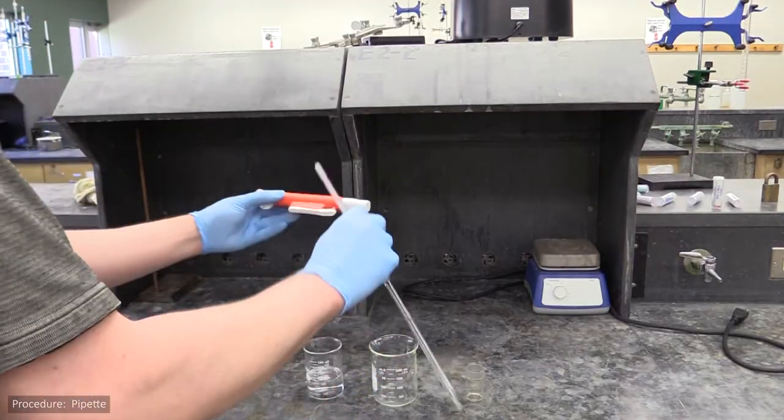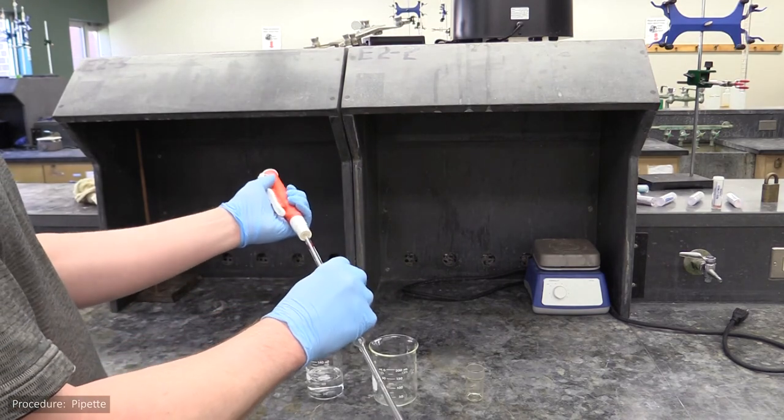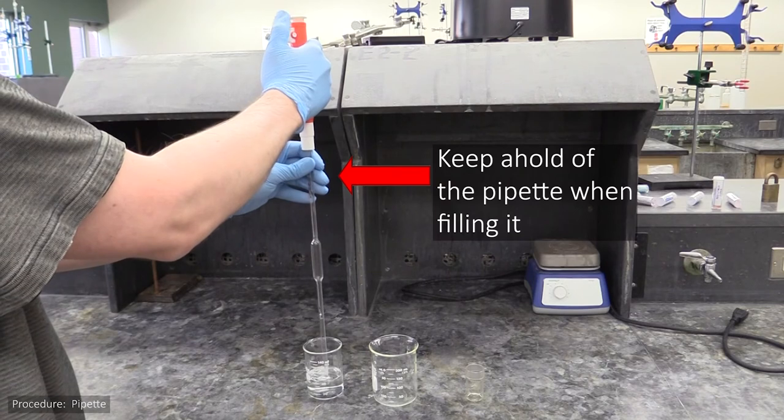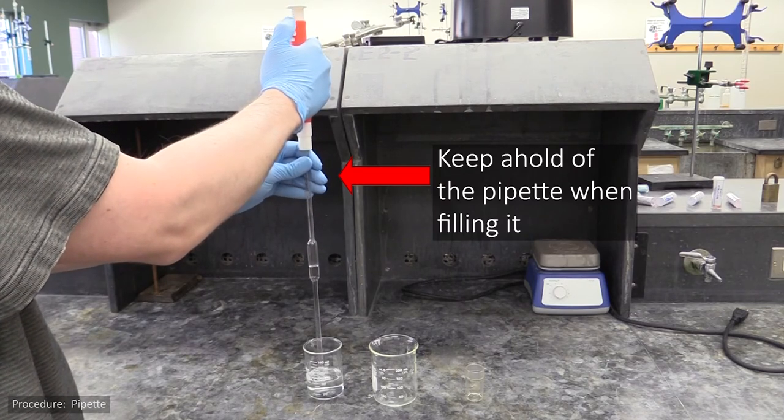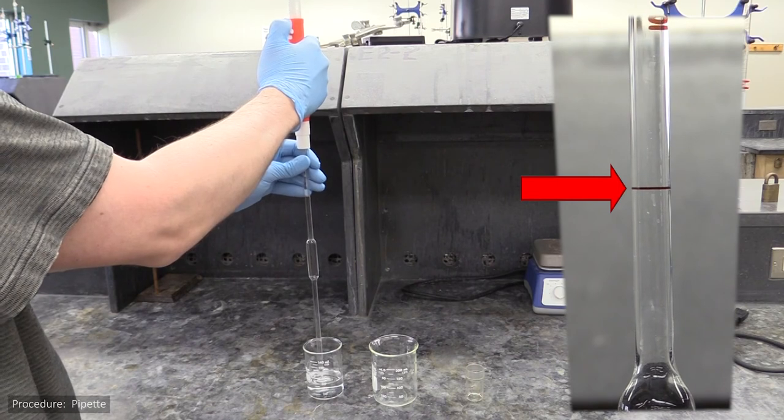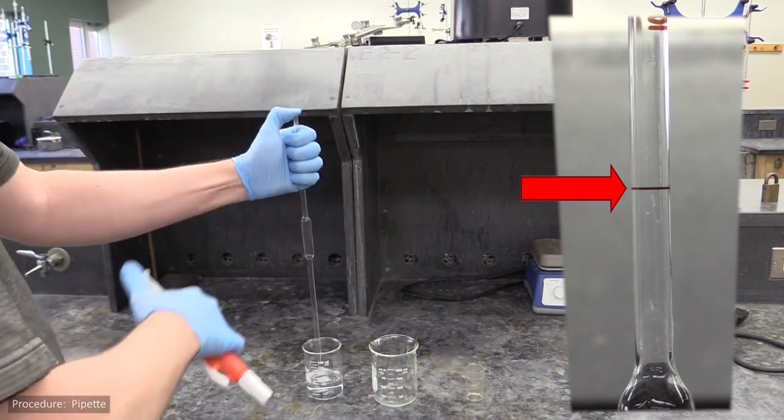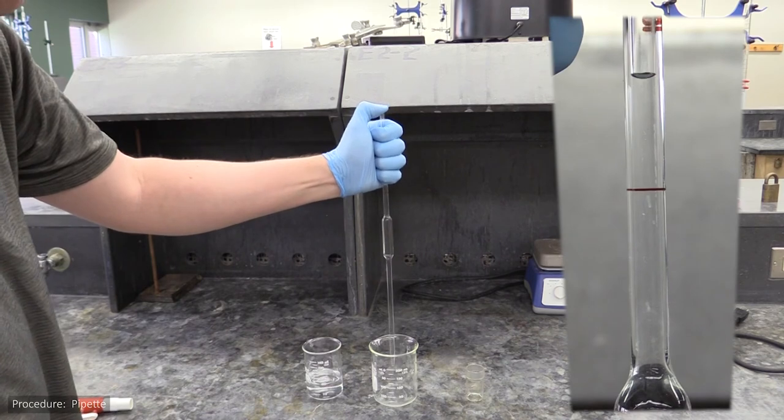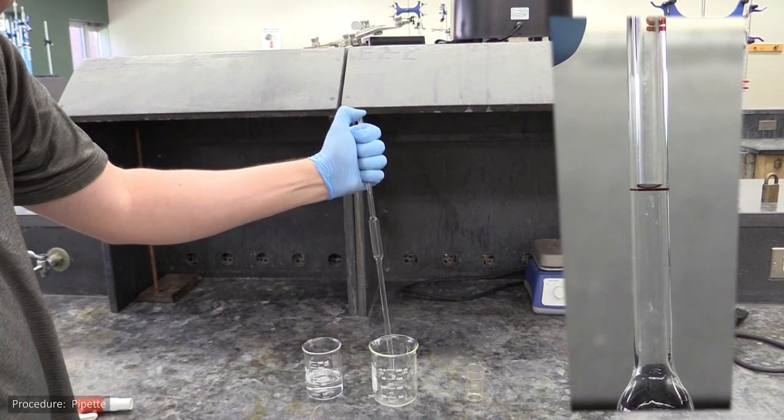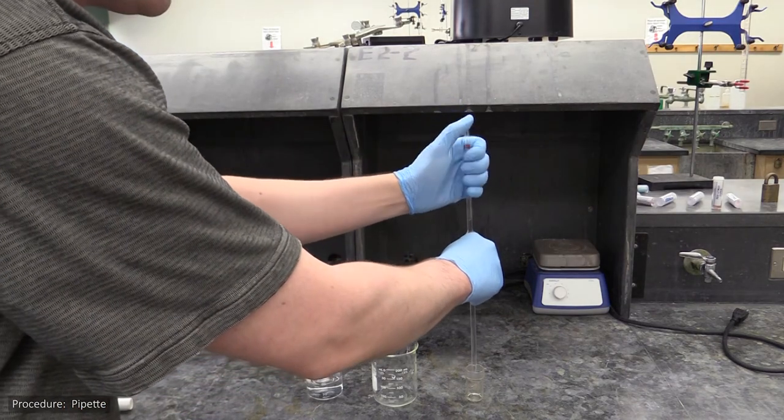As with the burette, you'll use your pipette to dispense water into a weighing bottle and weigh the bottle before and after. To use your pipette, you first use a pump to draw water up to just past the pipette's index line. You then take the pump off and use your thumb or finger to hold the liquid up. Then let it drain down to the line and let it gravity drain into your weigh bottle.